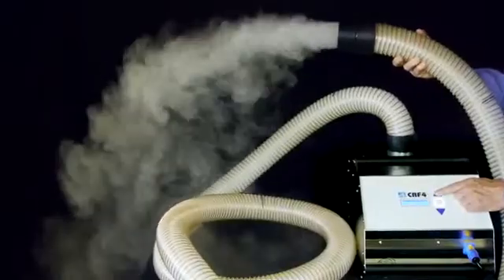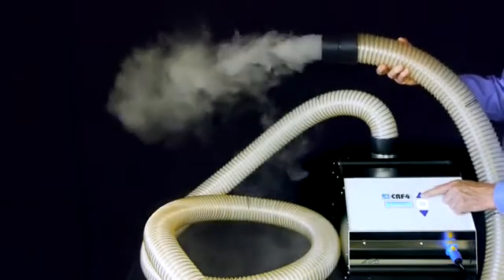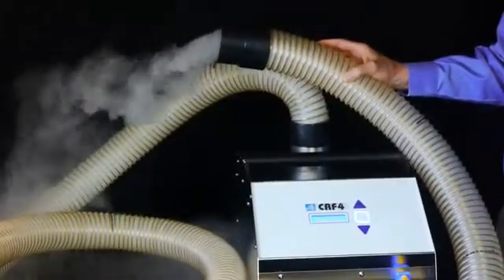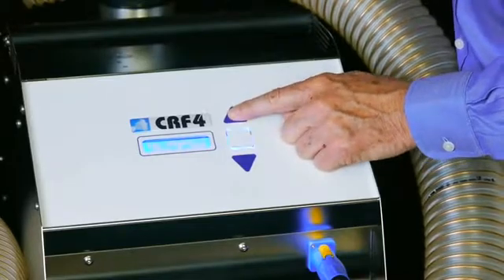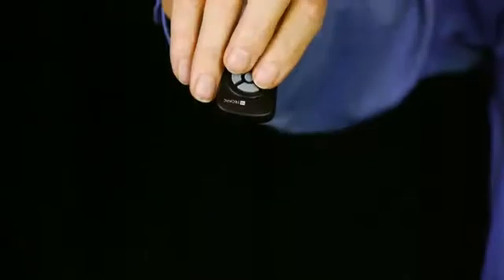When considering a fogger for your clean areas, ask how much fog density, fog volume, and visual fog distance is provided. The CRF4 provides instant on-off fog with adjustable fog volume and airflow velocity, with direct touchpad control, or wireless remote control for operation at a distance or behind a closed wall.